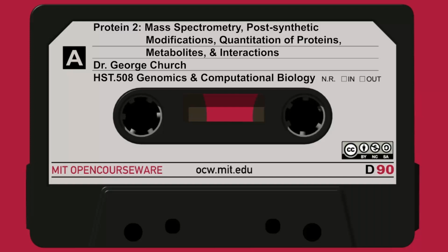Now, if you take one of these little two-dimensional spots and zoom in on it and look at it in greater detail, you see that it actually is a complex set of peaks in the mass direction and fairly simple in the retention time. Now, you could say, well, maybe these are all different peptides, but in fact they are trivial relatives of each other, where you can data mine and get additional information. So each of these is a separate isotope peak, meaning, remember, that it might have 40 carbons in this peptide, and so it's going to be a binomial distribution where this is the case where you have 0 carbon 13s. In other words, it's all carbon 12s.